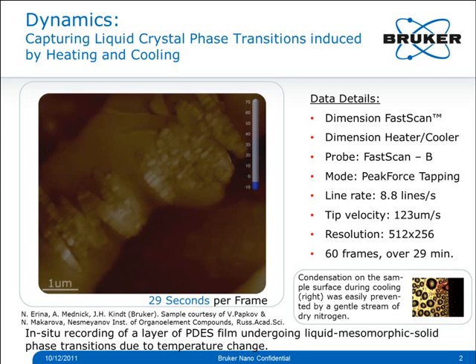This data was taken with the Dimension FastScan using the Dimension Heater Cooler, FastScan B probes, and was recorded in Peak Force Tapping mode at a line rate of 8.8 lines per second and a tip velocity of 123 microns per second at a pixel resolution of 512 by 256 pixels.